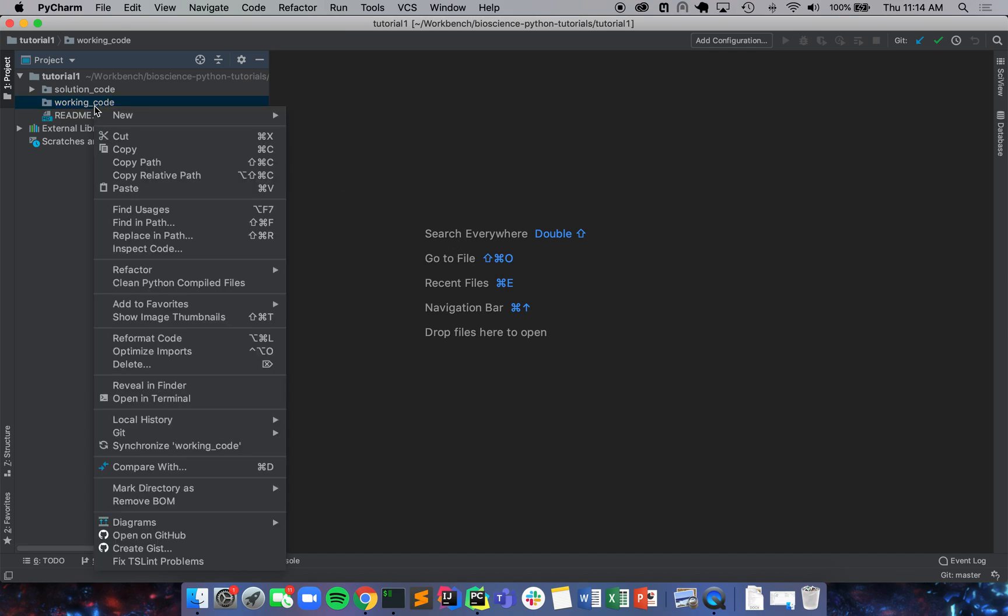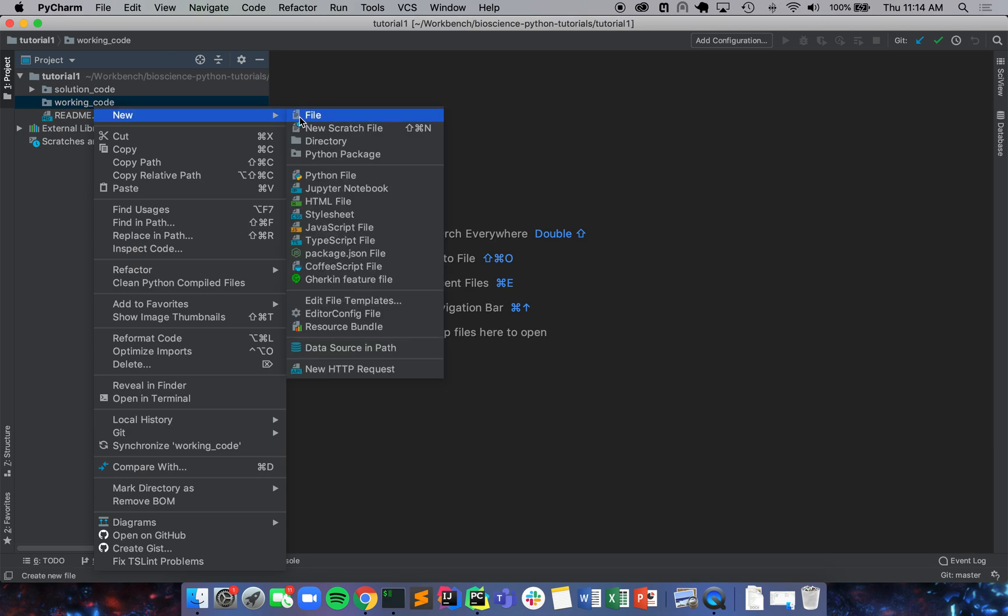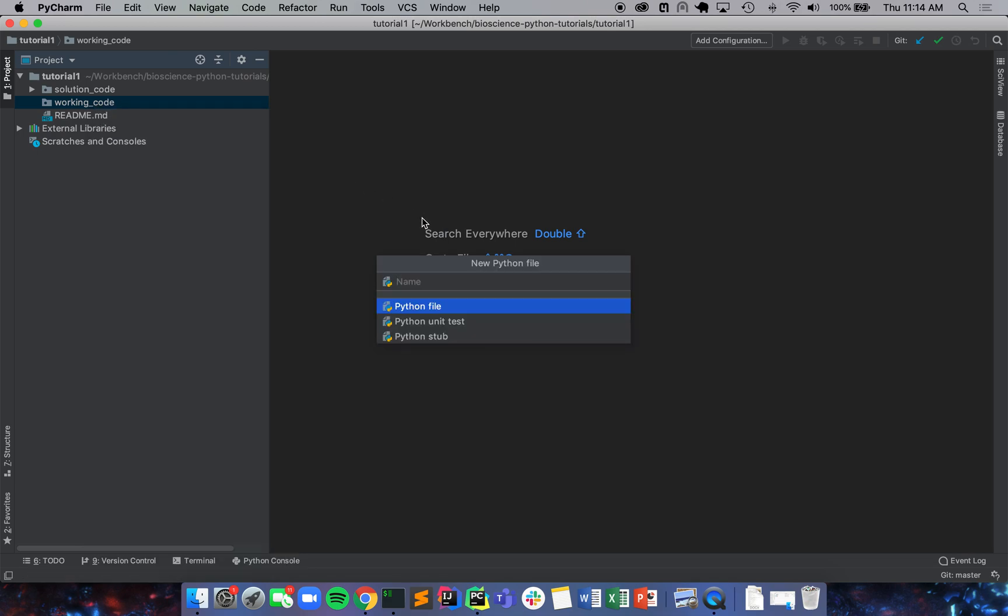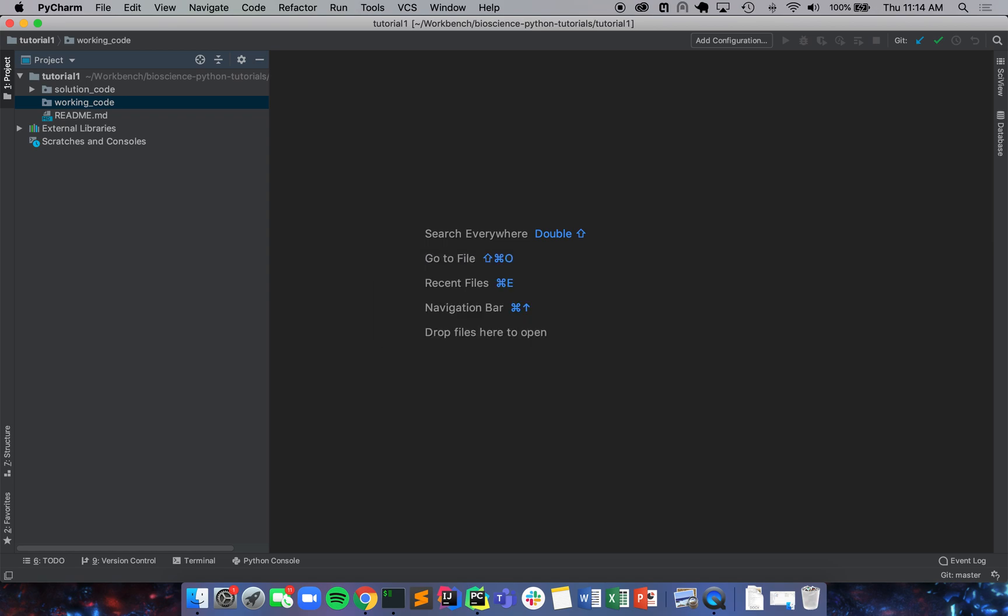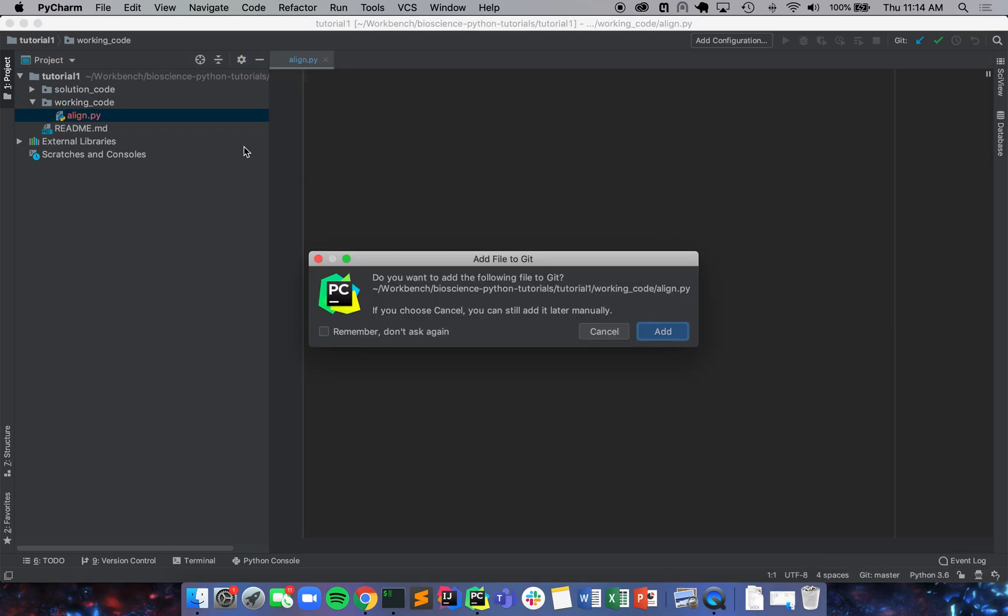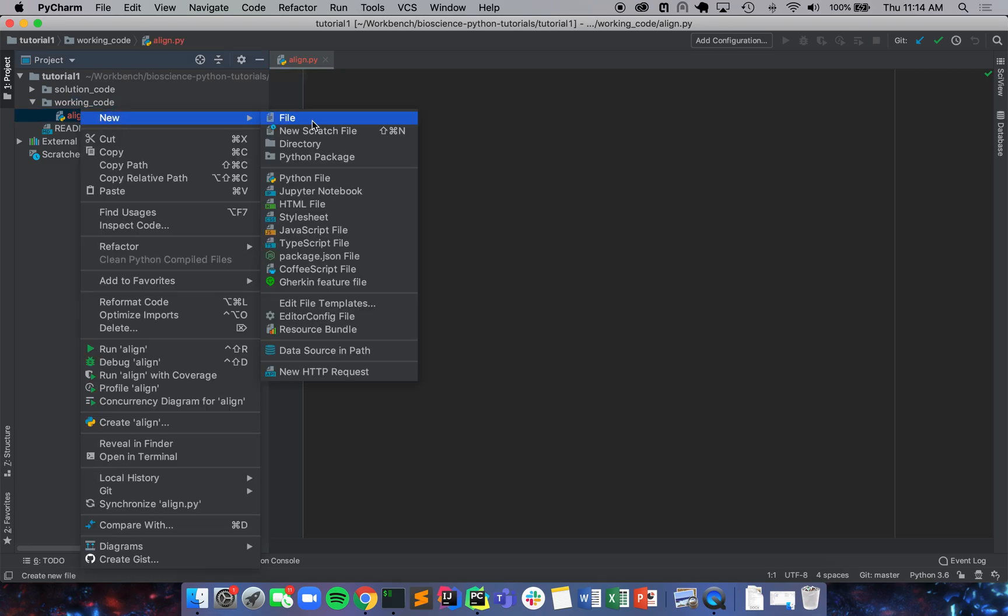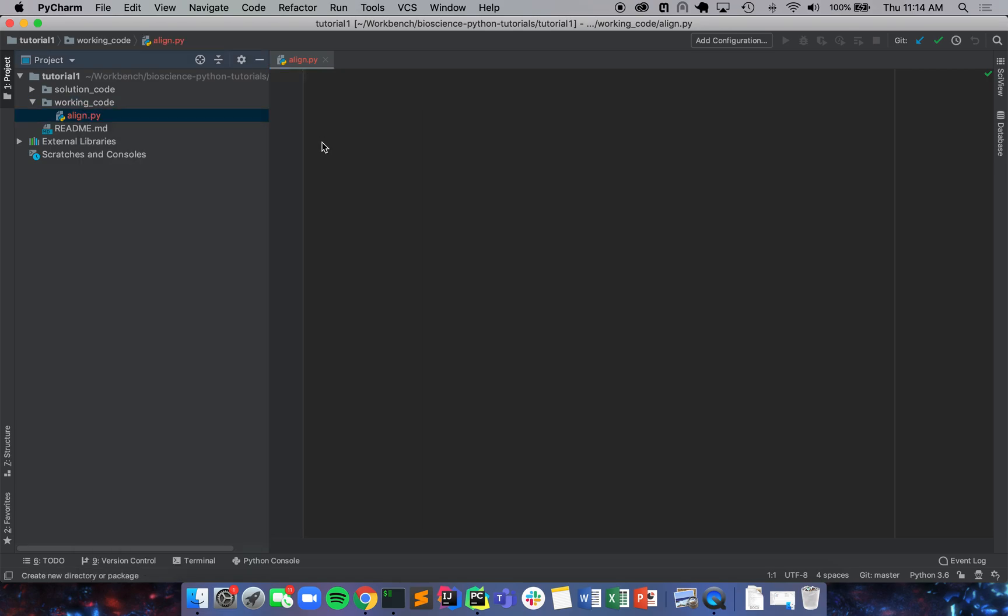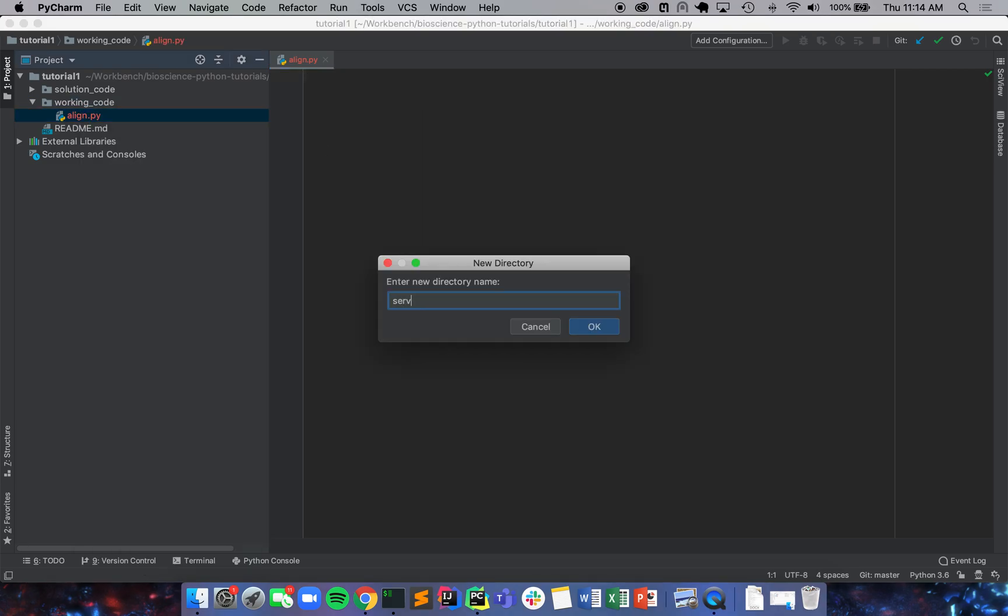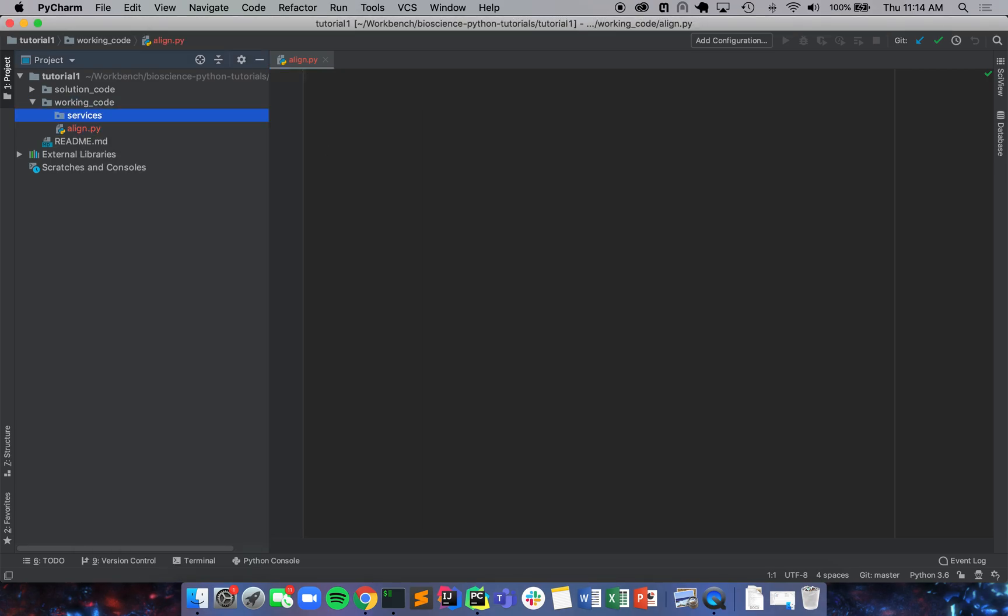So the first thing that we're going to do is we're going to set up our project in a way that I like to set up my projects. We're going to make our runner file and we're going to call it align.py. And we're going to also make a directory called services. And so services is where we're going to keep all of our helper functions, but we're not going to really use any of them right now. Right now we're just going to make the command line interface.